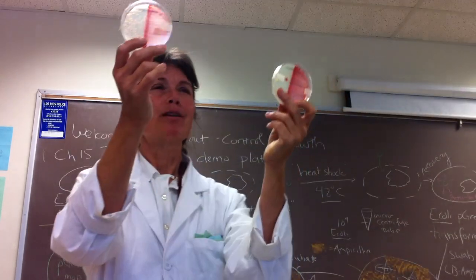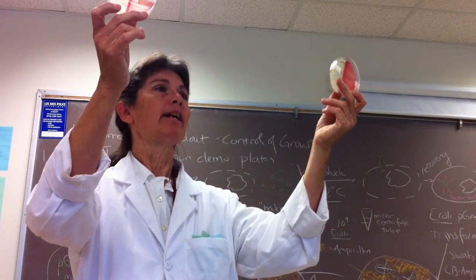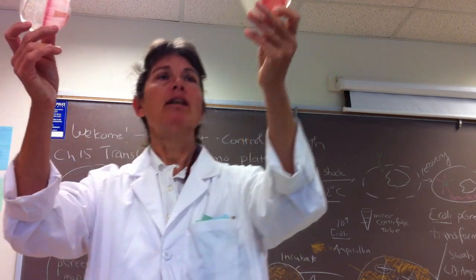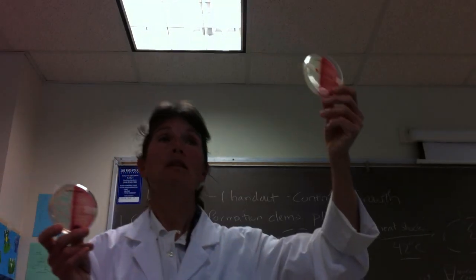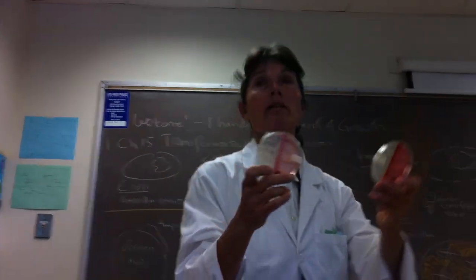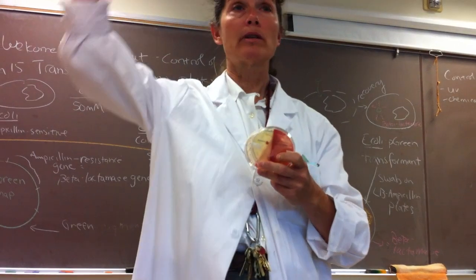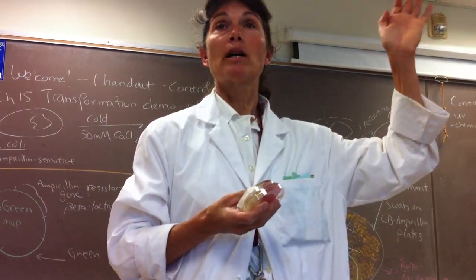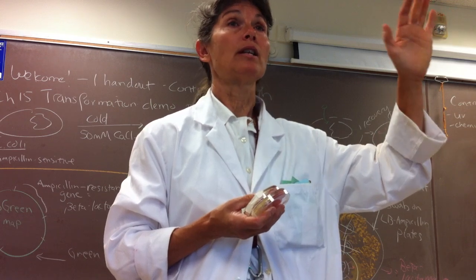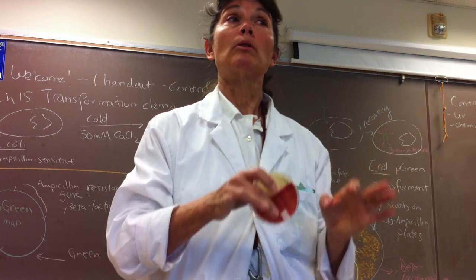Okay. Did the UV irradiation kill some of our bacteria? Yes. Yeah, we had huge kill. And if you take a look at your 4-minute irradiation plates, on many of the plates there's nobody growing on the 4-minute side, right? So that shows that UV irradiation can kill contaminating environmental microbes. So that's one reason why it's used in operating rooms when nobody's present. It's a reason that they're used in microbiology safety hoods to kill any contaminating microbes when people are not working.